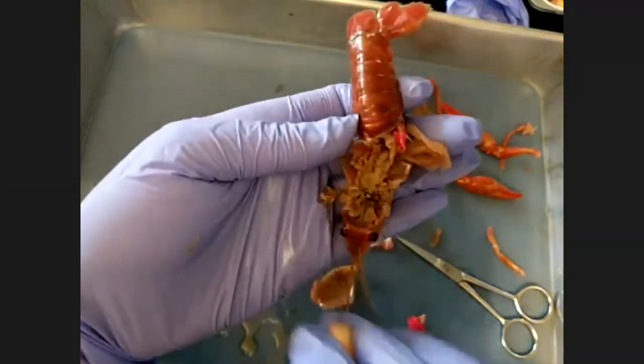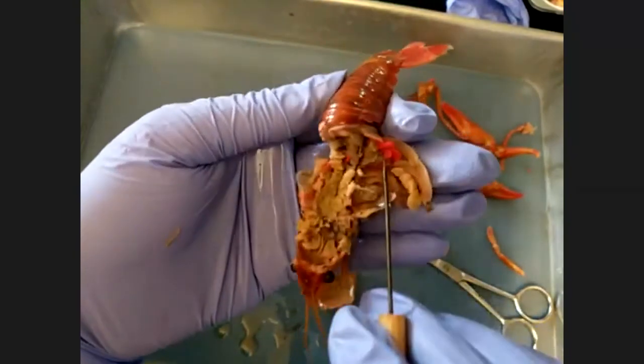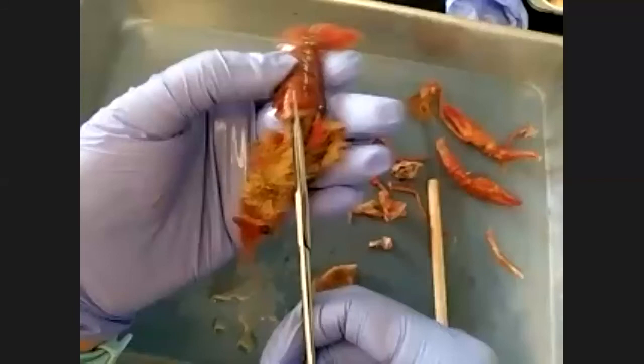More digestive stuff, more digestive stuff. I think I might have accidentally cut through it again on this one. I didn't cut through it in first hour, but it seems to be my problem.